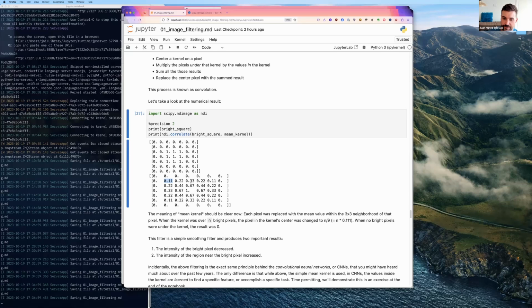You can do the same thing for every position in the image, including this middle one. In the middle one, you do 1/9 times 1 on all positions, and you get your 1 back.